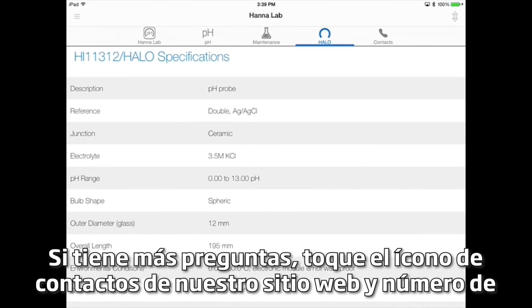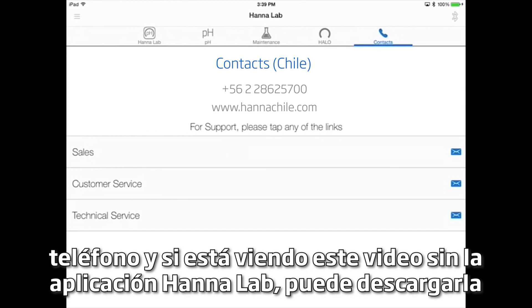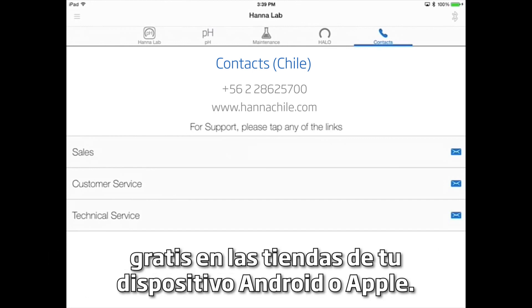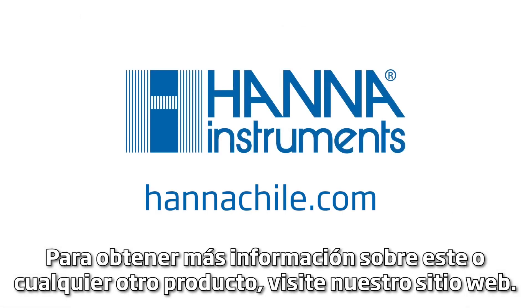If you have more questions, tap the contacts icon for our website and phone number. And if you're watching this video without the HANA Lab app, you can download it for free in Apple's App Store. For more information about this or any of our other products, visit our website.